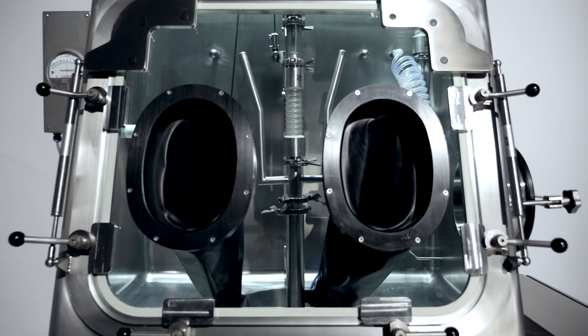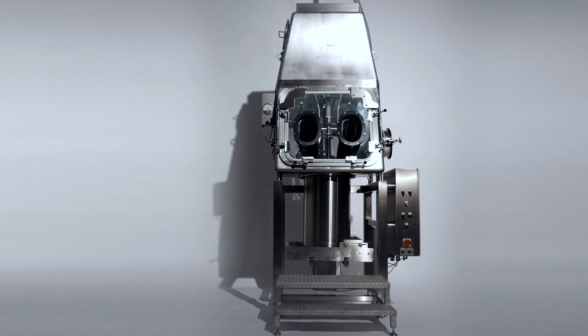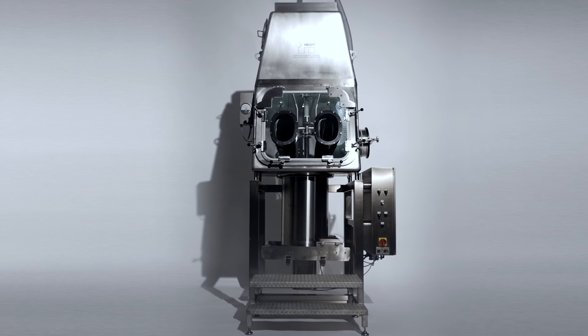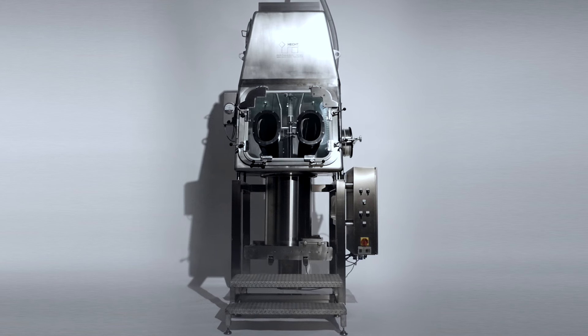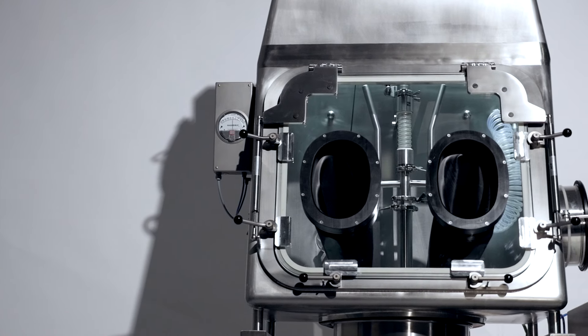In combination with the Pneumatic Vacuum Conveying System, a containment level up to OEB5 can be reached. Customised to your individual process and requirements, the system allows a simple, ergonomic and, of course, safe discharge of powders.